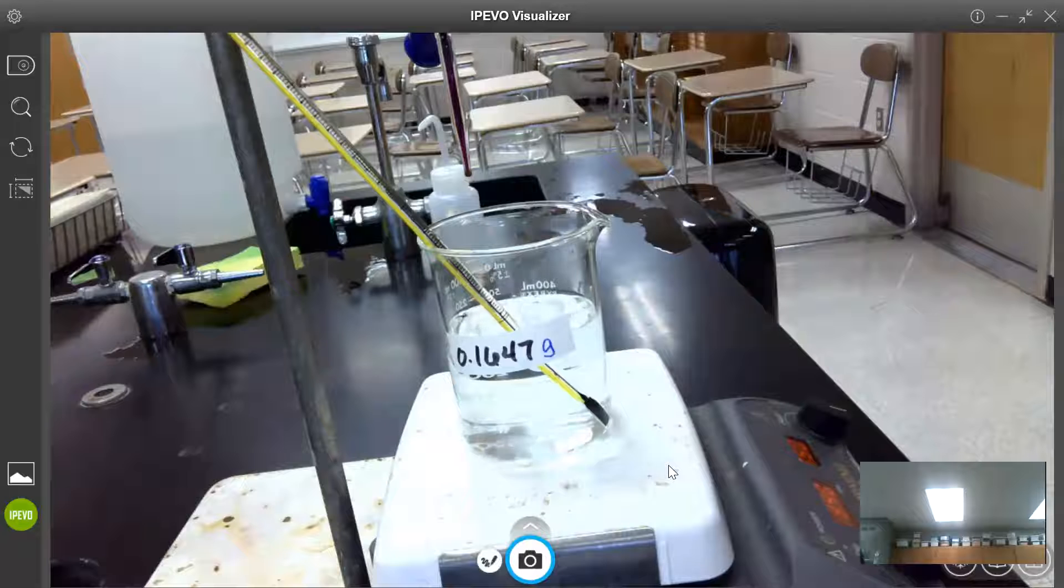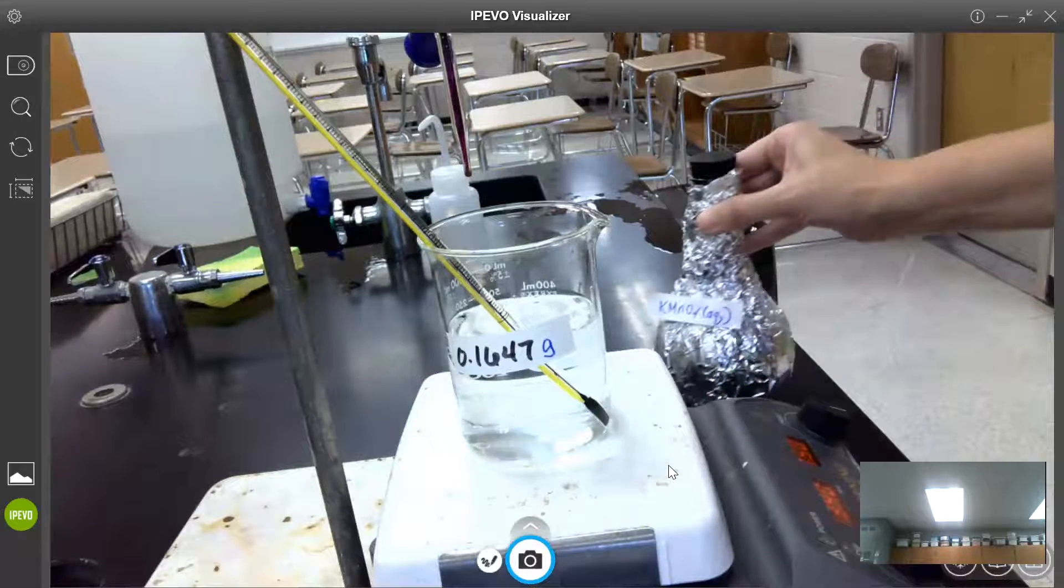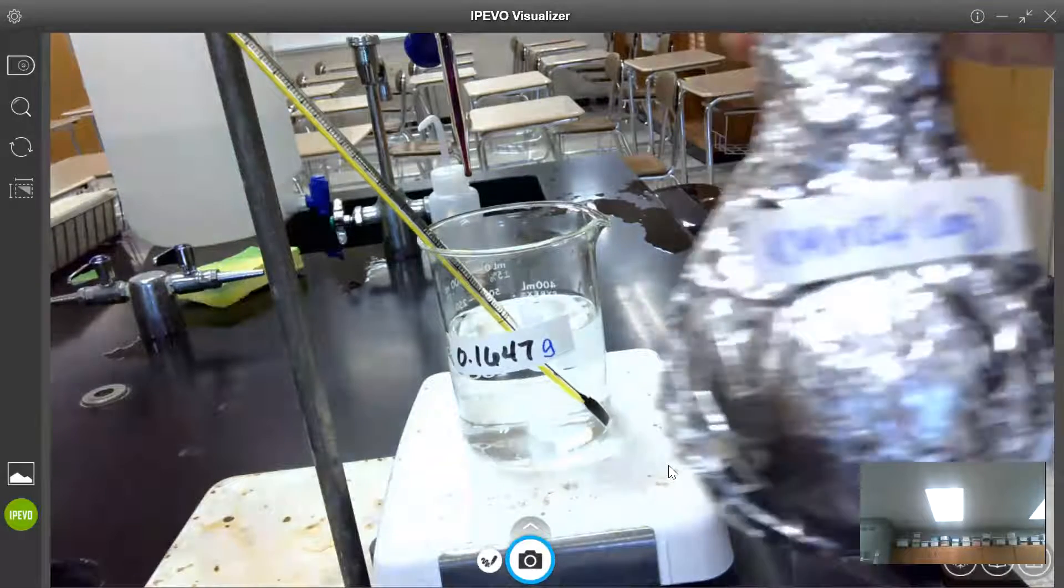And so while that's happening I'm going to show you my data table and I'm also going to show you the titration setup. So first the titration setup.